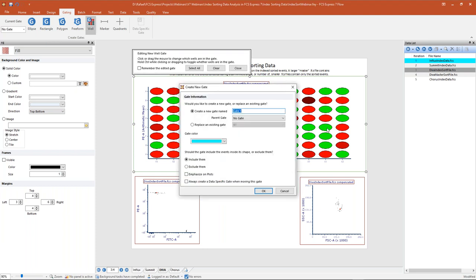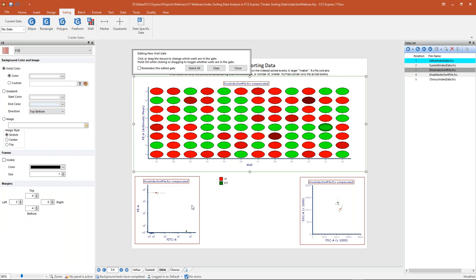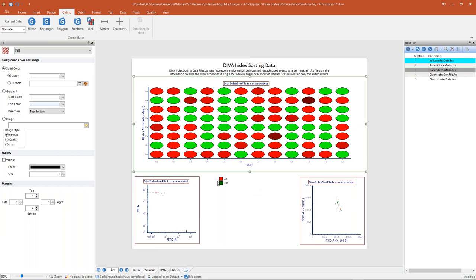If we wanted to create another single well gate, we just repeat the process. I'll go back to my well gate, this time selecting well E11 — a different color well. I'll call this my 'E11 single well,' color it green, emphasize those on my plots, and click OK. Now my green dot has appeared on those plots. If we look at our color dot plots below, it turns out E11 contained a FITC positive cell while A1 contained a PE positive cell, and those two cells fell into distinct populations within my scatter plot.